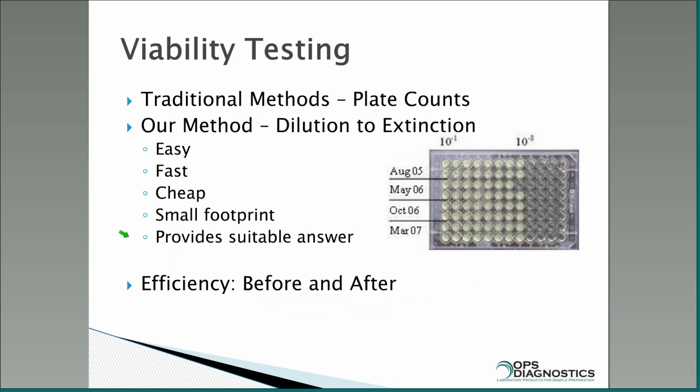So in discussing that, how do we do our viability testing so you can test this? And I'll get back to that stability in 1 second. But traditionally, people would do plate counts, just standard microbiology, with serial dilutions and pouring them out in plates and counting them. I find that a tremendous amount of work. I find it uses up a lot of supplies, uses a lot of incubator space.